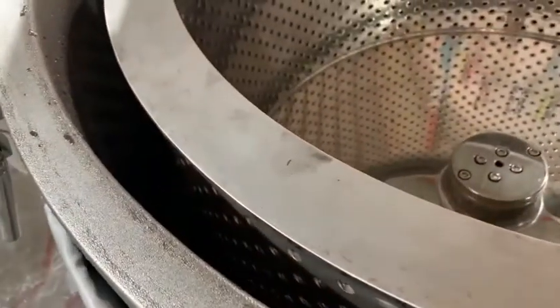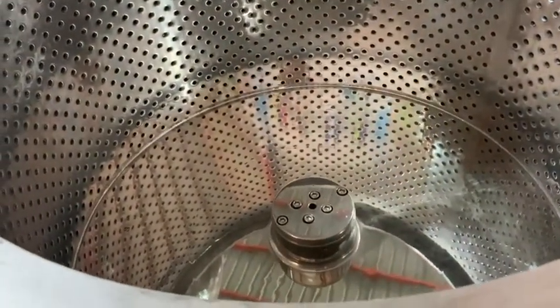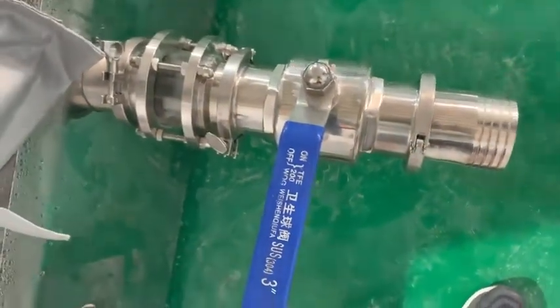There is one interlayer and you can put ethanol into here. And you can put plant material into this drum. And this is the charge pot.